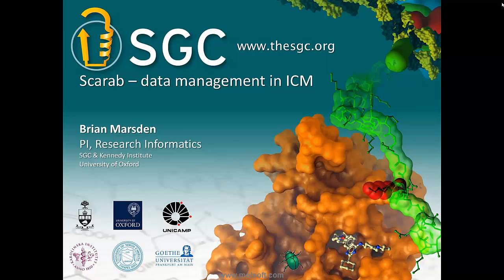So first of all, Andy, thank you very much for the invite to talk today about what we're doing at the SGC and how we've worked with MolSoft. What I want to do during this hour is a couple of things. First of all, I want to give a very brief introduction about what the SGC is about and what we've done and why we have been working with MolSoft to develop a platform that allows us to do good data management. I'm going to talk a little bit about what for us is good data management and how it helps us. And then I'm going to go into the actual product itself, which is called Scarab, and if time permits and if we don't have any technical glitches, I will be showing a few demos along the way to show you some flavors, at least basic flavors, of what the platform can do.